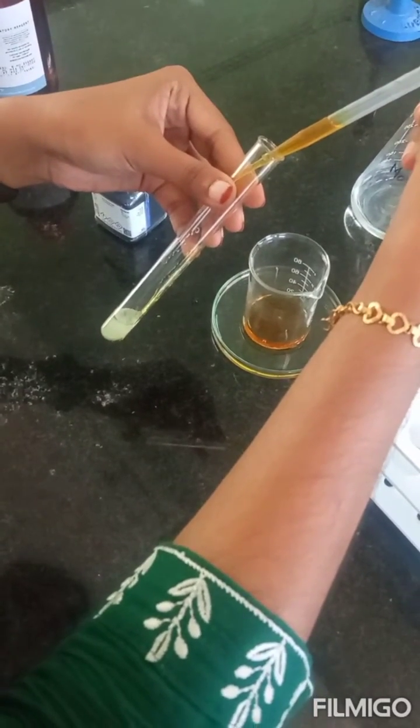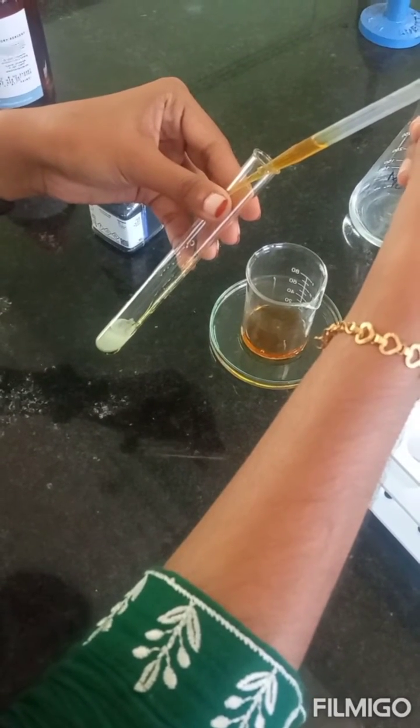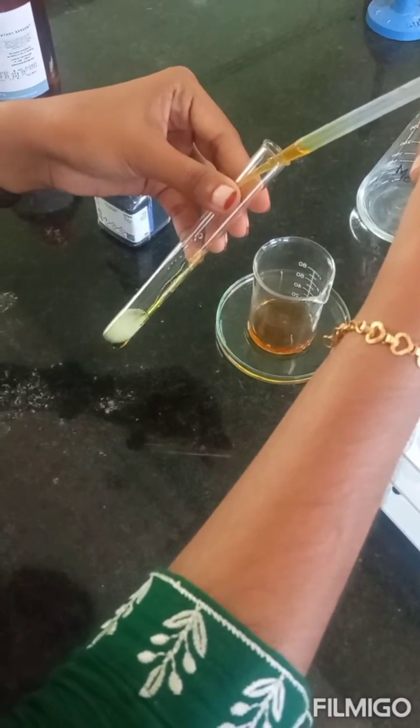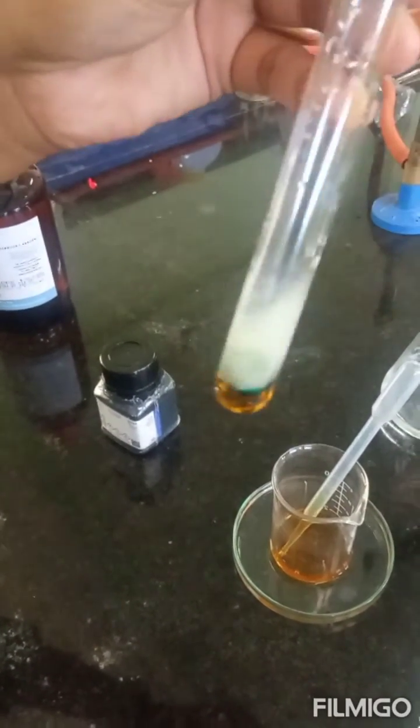Between the two layers, we can clearly see a green color that is produced. This is a general test for all carbohydrates including monosaccharides and other carbohydrates — the appearance of green color indicates a positive result.